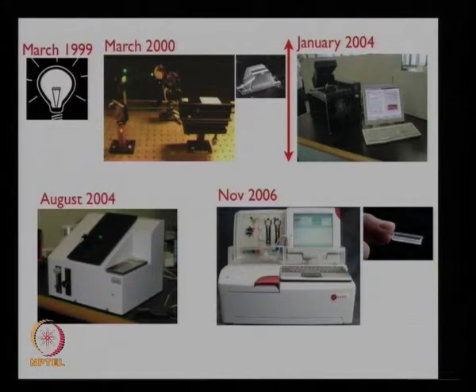But what we did is we translated it into a series of steps so that the current device that went out in the market in late 2006, early 2007, is an instrument that other people can use. And that little piece of double-sided sticky tape is not really going to be good for you to make yourself. It's now a little piece of plastic that's a lot cheaper. It took a lot to get there, but it's now much more efficient and cheaper.